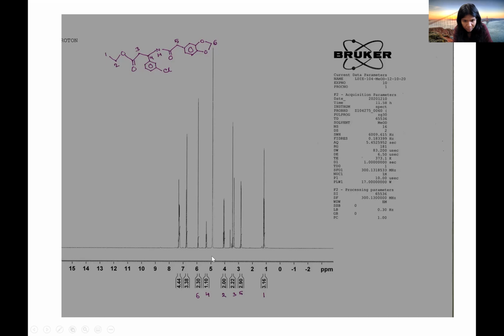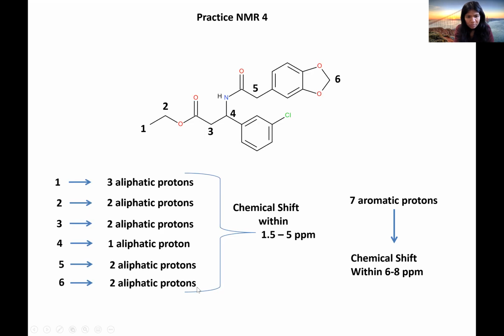So as you can see from these integration values, we have one corresponding to 3 protons, another for 3, another for 2, another for 2, another for 1, and another for 2. So we are looking for exactly the same thing over here.